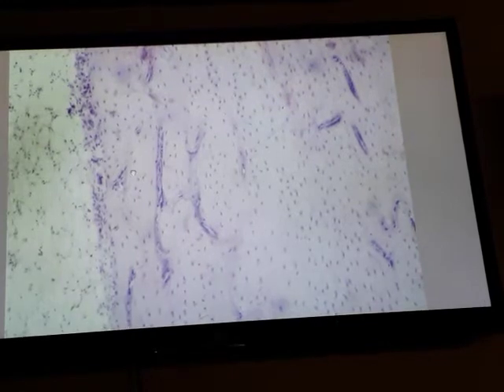These lacunae contain the osteocytes. Only one osteocyte occupies a single lacuna. This is the bone marrow. The lacunae slides are stained with H&E stain.